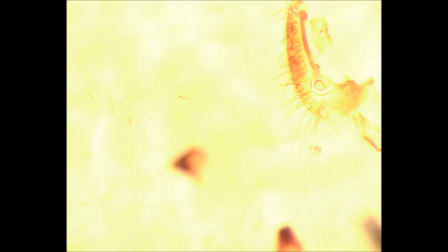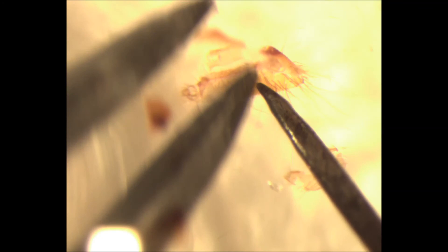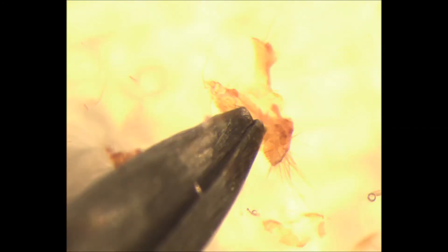So there's the labrum, the upper surface of the labrum. The lower surface is the epipharynx. I'll hold that down with the forceps. I'm going to cut along this line between the clypeus and the labrum. You can get from underneath so you can see the rods, the epipharynx floating up. I'm going to just slice here.